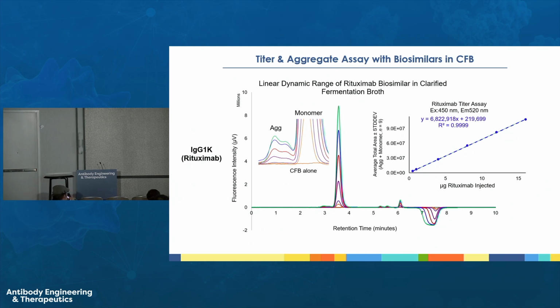And this is really easy to quantify anything from a linear curve rather than from a sigmoidal curve. Another advantage of using fluorescence is that the fluorescence detector settings can be varied quite a lot. So you can change the range of this curve. You use a more sensitive detection, you can go to dilute solutions. You dumb down your detector, you can really use high concentrations. So you can use it at almost any stage of the development process or manufacturing process.